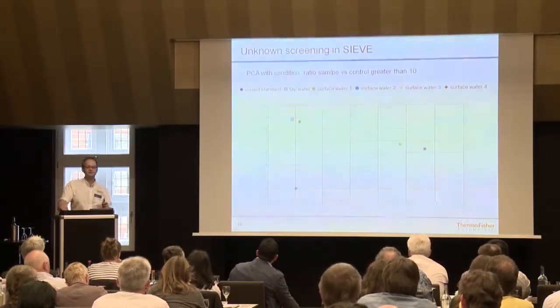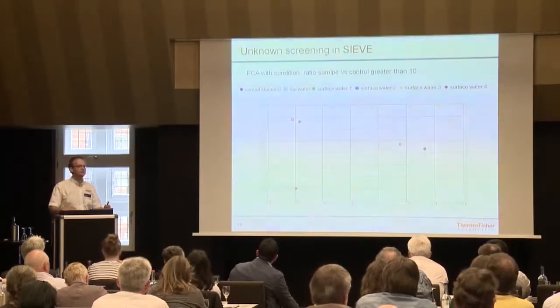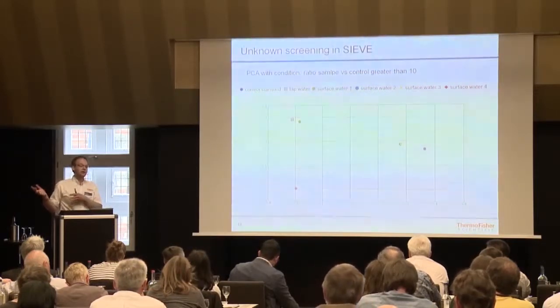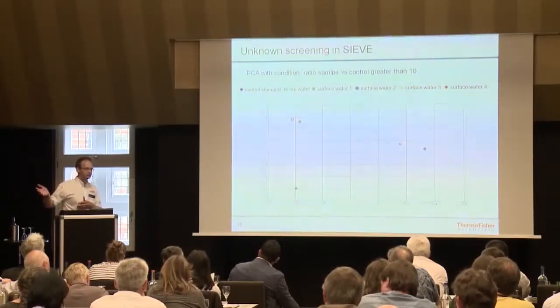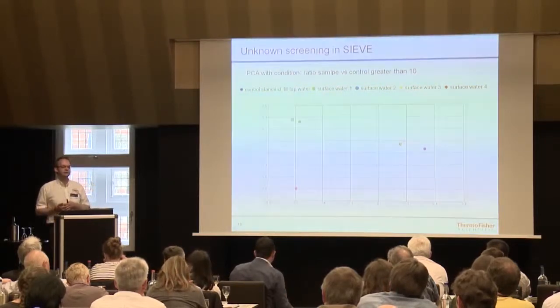So what you can do with such a PCA analysis is just to look into series of samples, and you can see the outliers. You can see which are really closely related, because certain food comes out of the same region, or certain food has always the same quality, and then you have an outlier, and something's happening there. So that could be, for example, the indicator of a contamination.